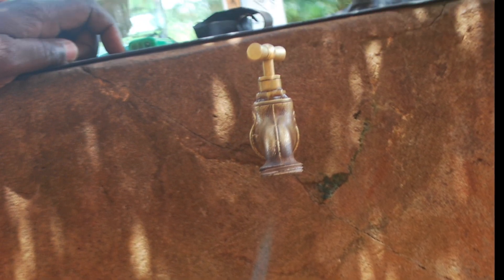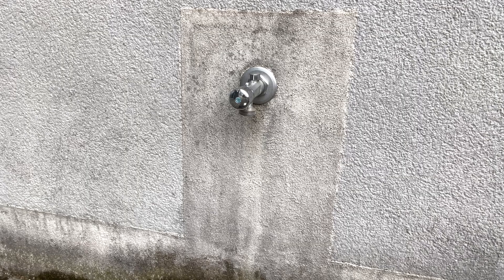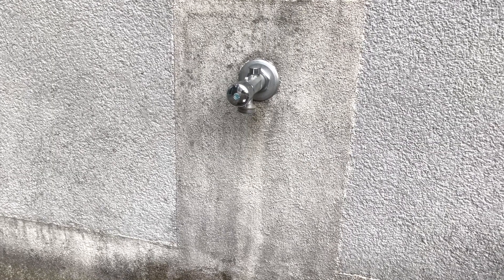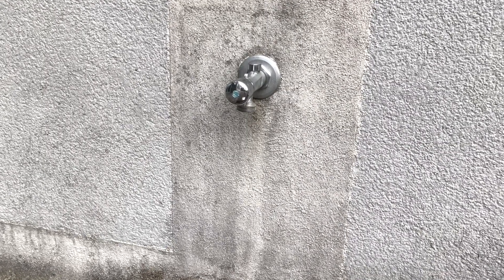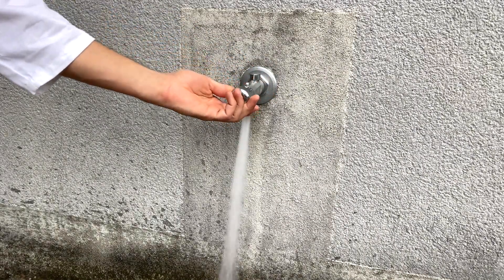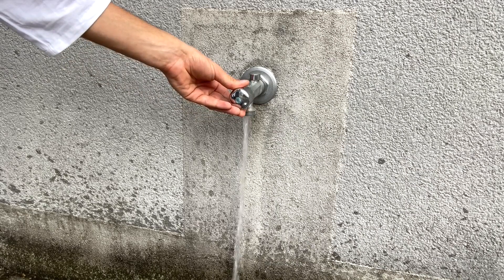If possible, sterilize it with a Bunsen burner. If the fitting cannot tolerate heat or a portable Bunsen burner is not available, wait three minutes for the alcohol to react and evaporate. Run the water at full power for twenty seconds.